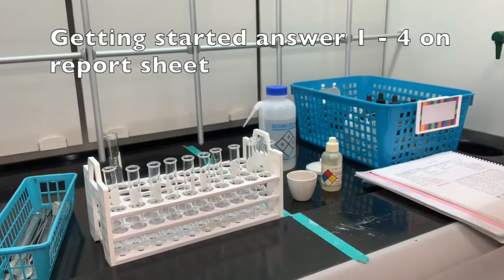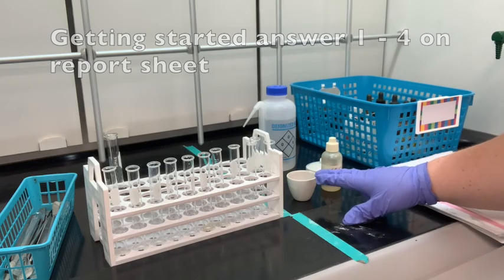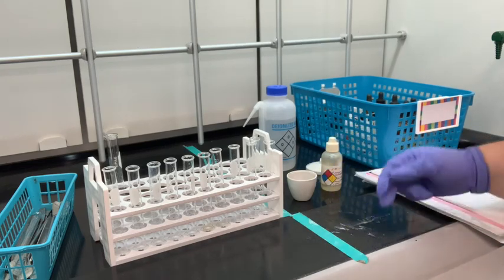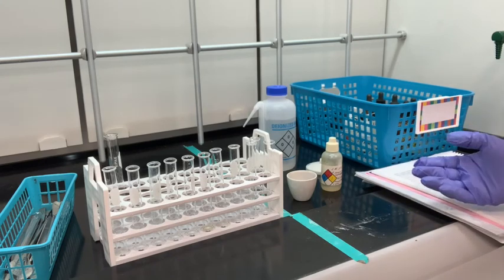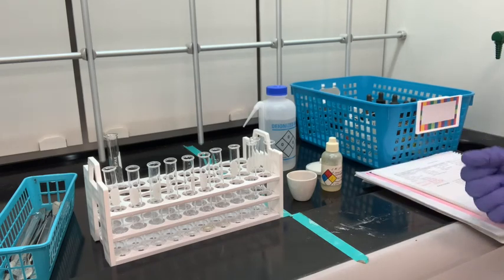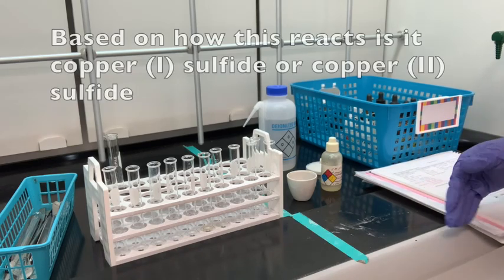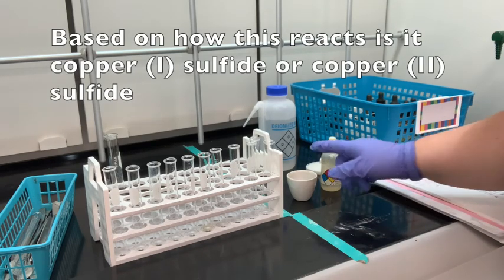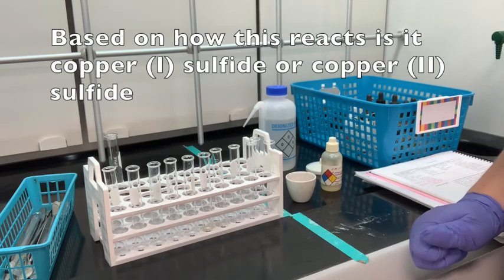The reaction between copper and sulfur has already been done. We had copper in our crucible. We covered it with sulfur several times. And then in the chemical formulas lab, you determined its empirical formula. But for this lab, we want to decide based on how the copper sulfide reacts, whether it's copper 1 sulfide or copper 2 sulfide.